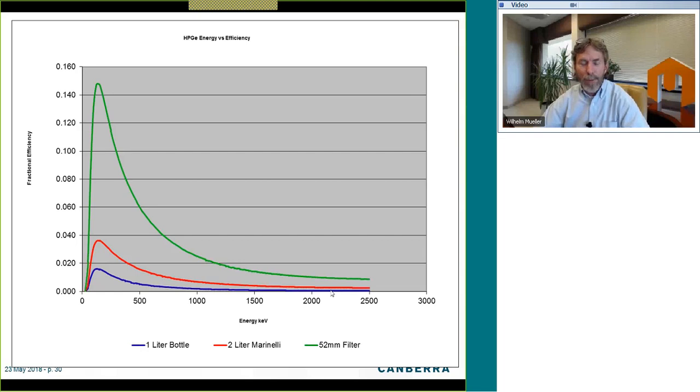We can see from this that the idea that Vern Kahn and his associates had in the 1980s in their development of the Radium-226 method at Georgia Tech had its roots in some good scientific merit here.